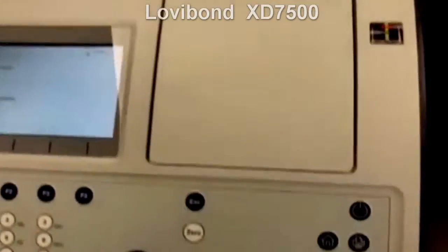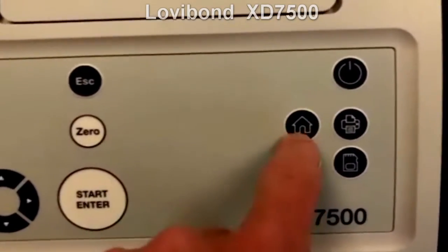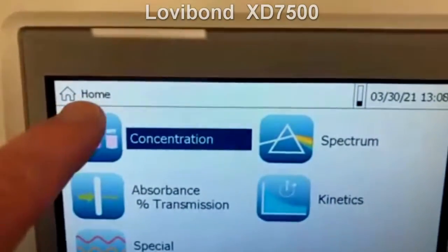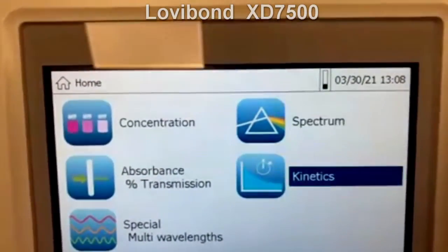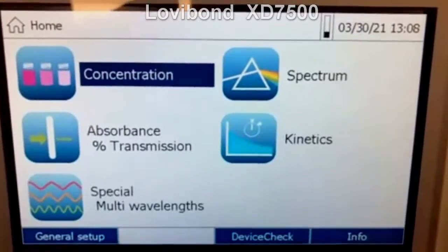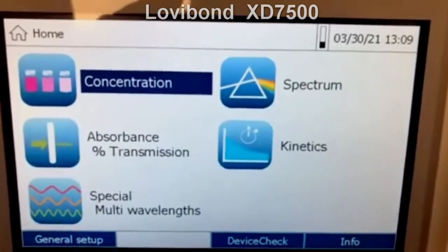Now I'll quickly review the other buttons. You have scroll up and down, start, enter, zero, and escape. Anytime you want to go back to the home screen, just hit the home icon — that always takes you back. You can also send results straight to a printer, or save them with a one-button push. We're now at the home screen, and the options from here are: concentration, spectrum, kinetics, absorbance and transmission, or special wavelengths. Concentration is the colorimetric methods area — where you'll automatically measure the concentration of different parameters. That's where your customer will spend the majority of their time, covering everything from alkalinity to zinc.